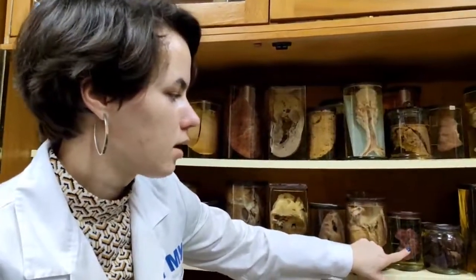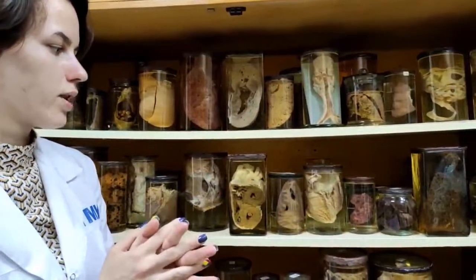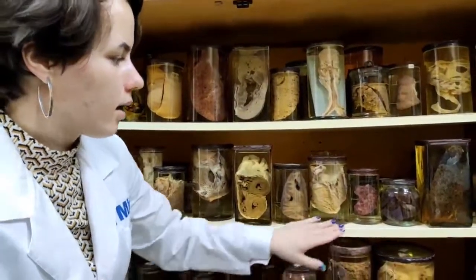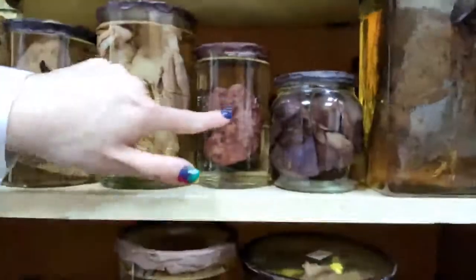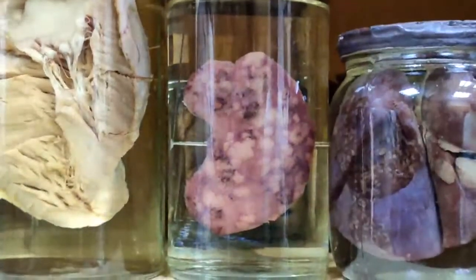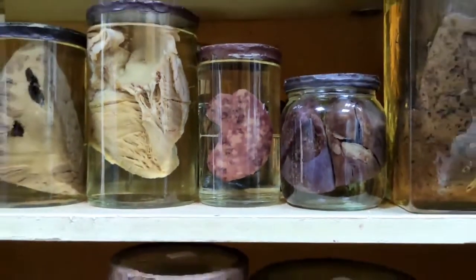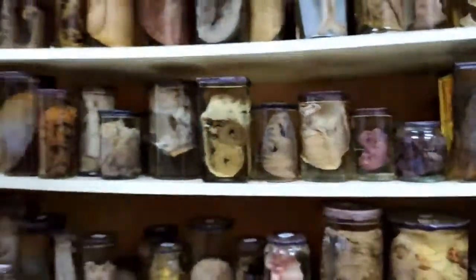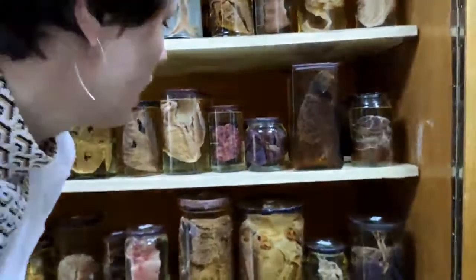And in this situation, we will see infarctions, because infarction is ischemic necrosis of the kidney due to obstruction of the blood vessel. You can see both changes, bleeding and infarctions. You should read a little bit more theory about this disease to understand why we see these two types of change, because it's difficult to explain quickly, but I think when you read, you will understand easily.